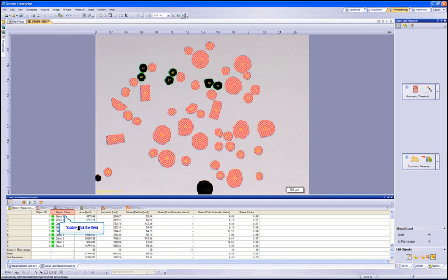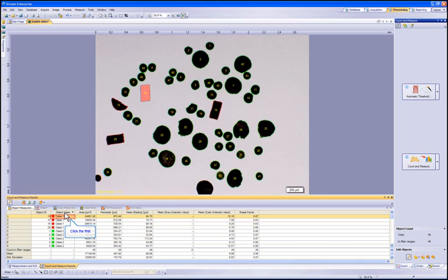By double clicking on the Object Class field, we can sort the two classes generated, allowing us to easily show the different particles. Let's click through the particles listed in Class 1. This class has separated the particles by their shape factor. This is the first class. This is the second in the list.